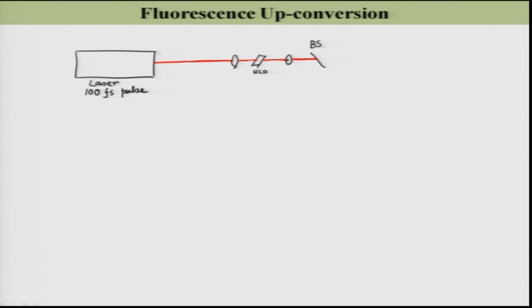So, it is giving me 800 nanometer light, but this light is not CW light, not continuous wave, this is pulsed light. So, light is present for some time and then for the rest of the time light is not present, and again probably at this position light is present, right. The difference between these two pulses is governed by the repetition rate of the laser, and each has some width, which I have already said is 100 femtosecond. Clear. So, this is the laser light.